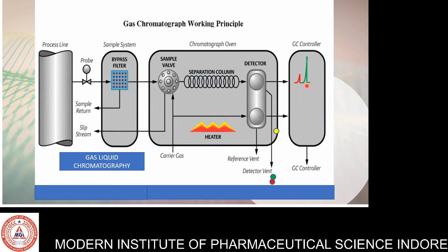The recorder should be generally 10 mV full scale, fitted with a fast response pen, 1 second or less. The recorder should be connected with a series of good quality resistors connected across the input to attenuate large signals.